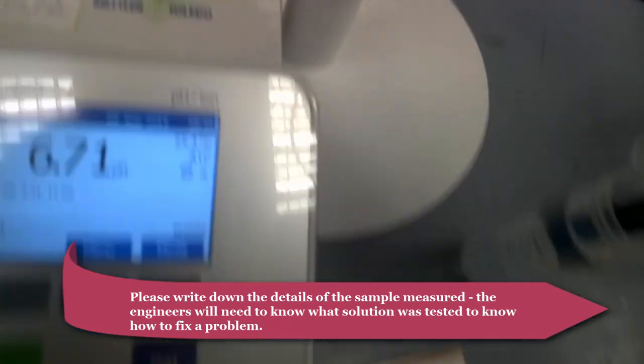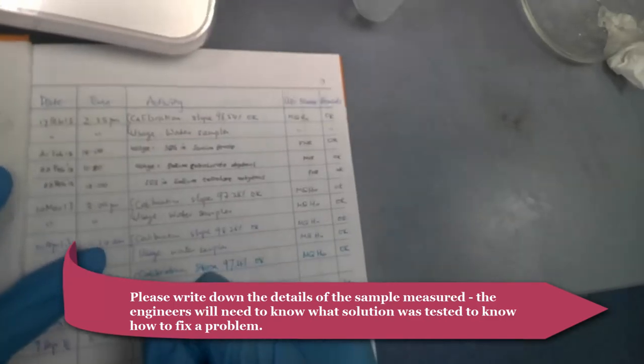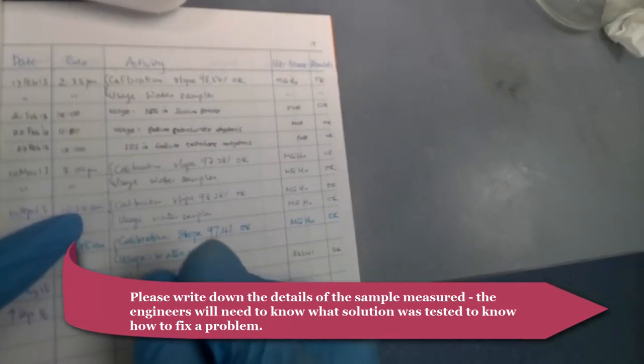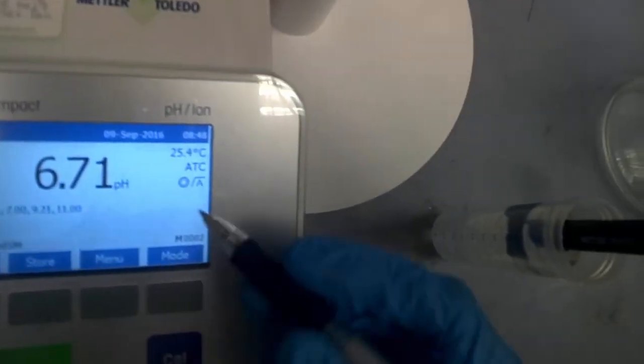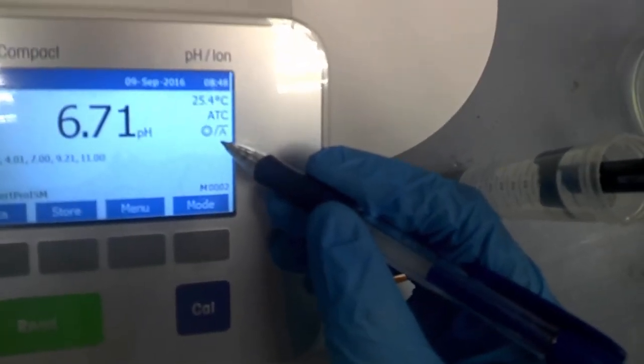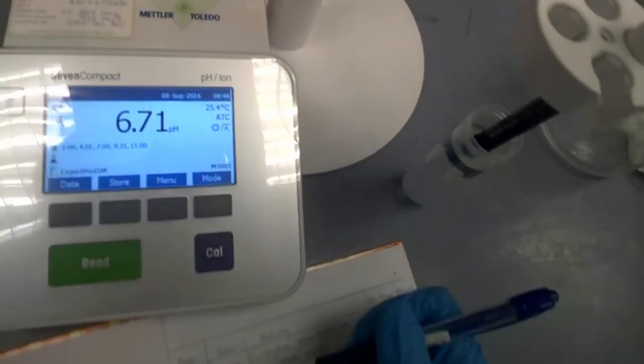Today's date is the 9th of September 2016. Time is 8:48 AM. This is calibration plus demonstration. I put video. Heard the sound just now? So that means now the reading is recorded. You see, it's not flashing anymore. pH of my unknown solution is 6.71. Good.